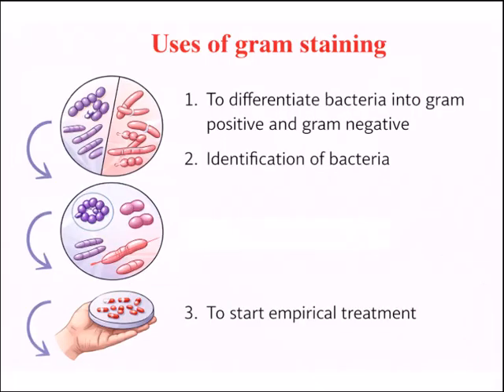Use of gram staining: it is used to differentiate bacteria into gram-positive and gram-negative bacteria, as we said before, and for identification of bacteria, and then to start empirical treatments.